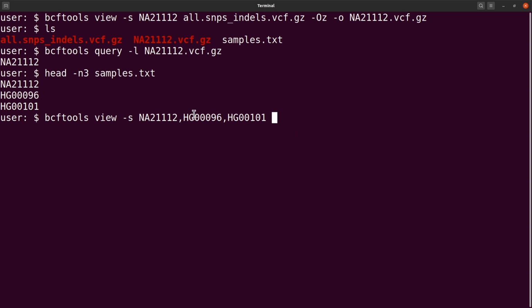Now when we come here, let me also say that even though here I use this one here, you can also bring this one last. So I'll try out a different variation here. So I'll say -O Z -O. Now this time we will not use NA. Let's just say subset.vcf.gz.